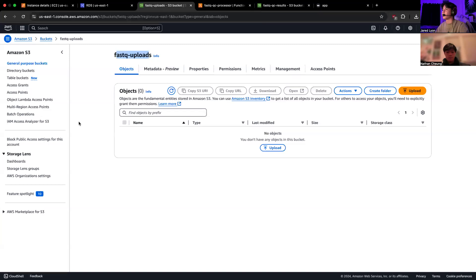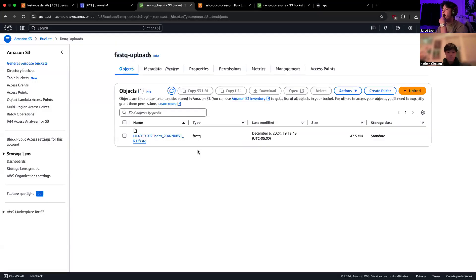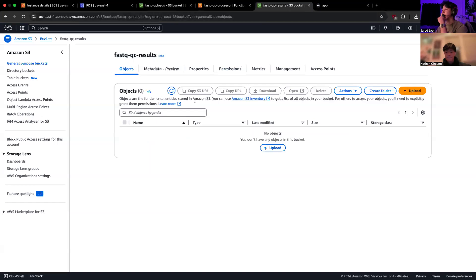We can go to our bucket right here and refresh the page. And then as you can see, our FASTQ file did get uploaded. And then hopefully when I refresh this, the QC processor will be done. And it is.